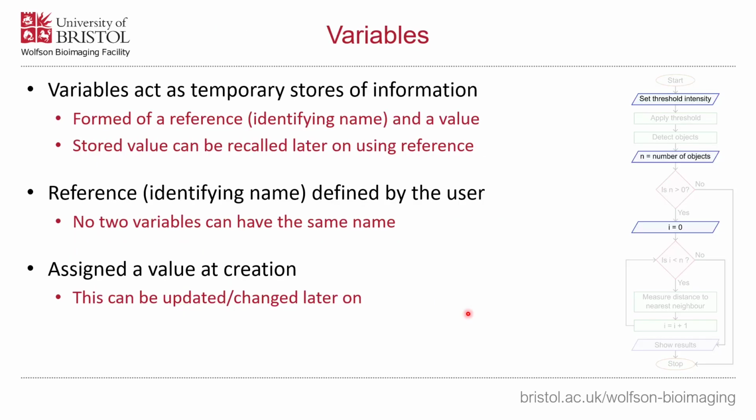So the first of the fundamental programming concepts we're going to look at are variables. And a variable is just effectively a reference to a piece of information in the memory.